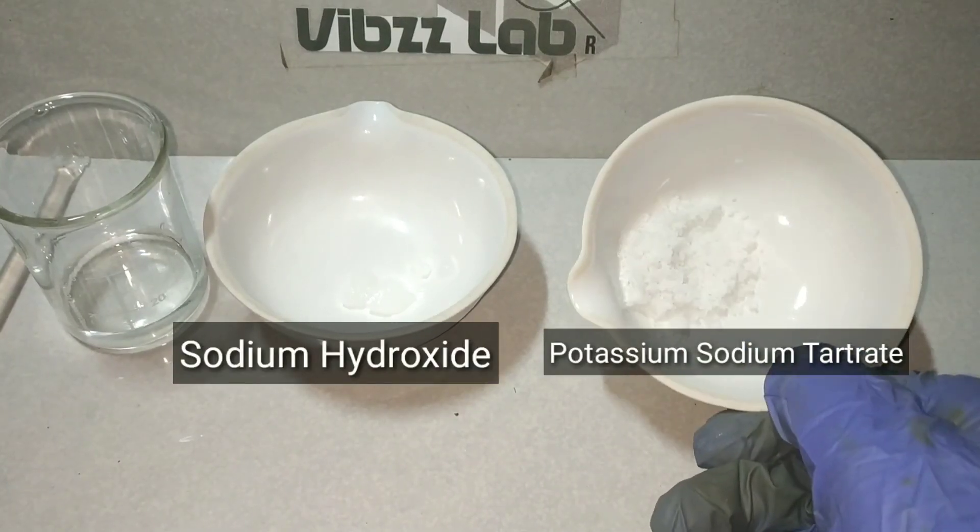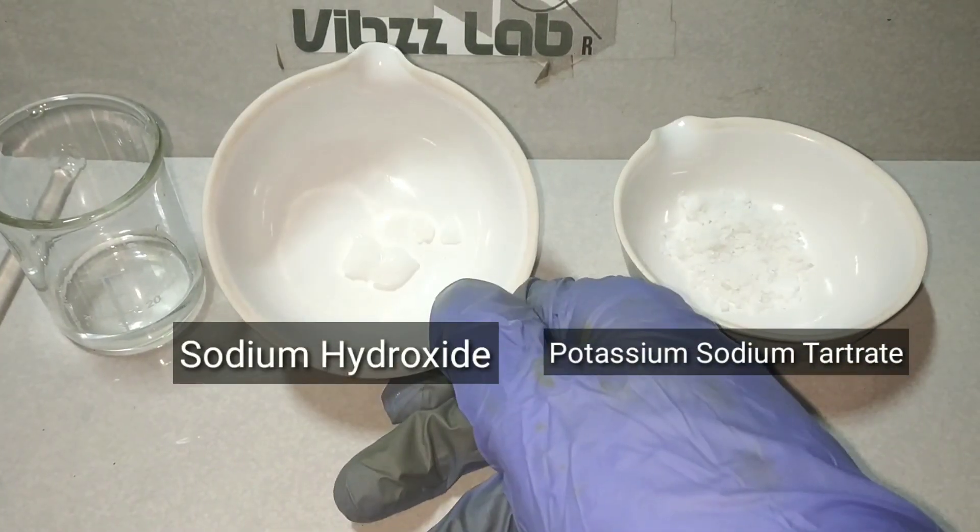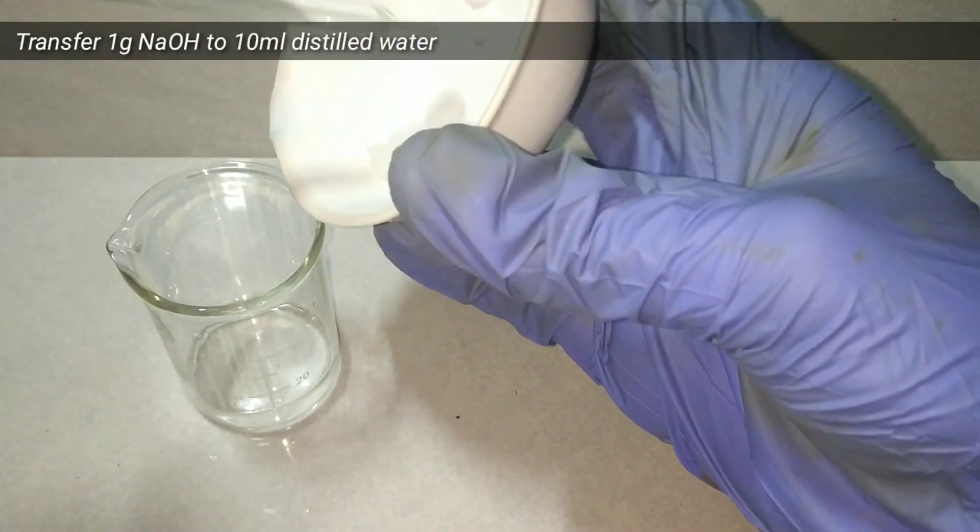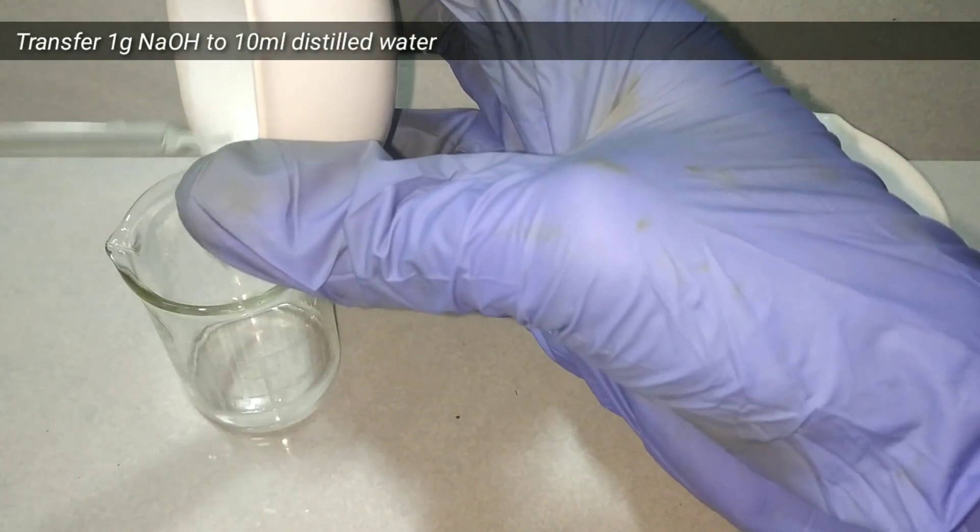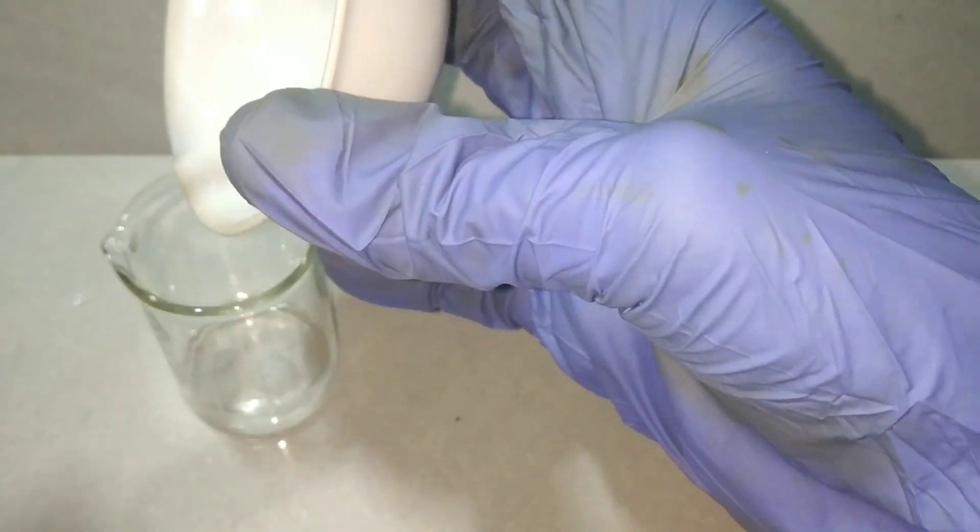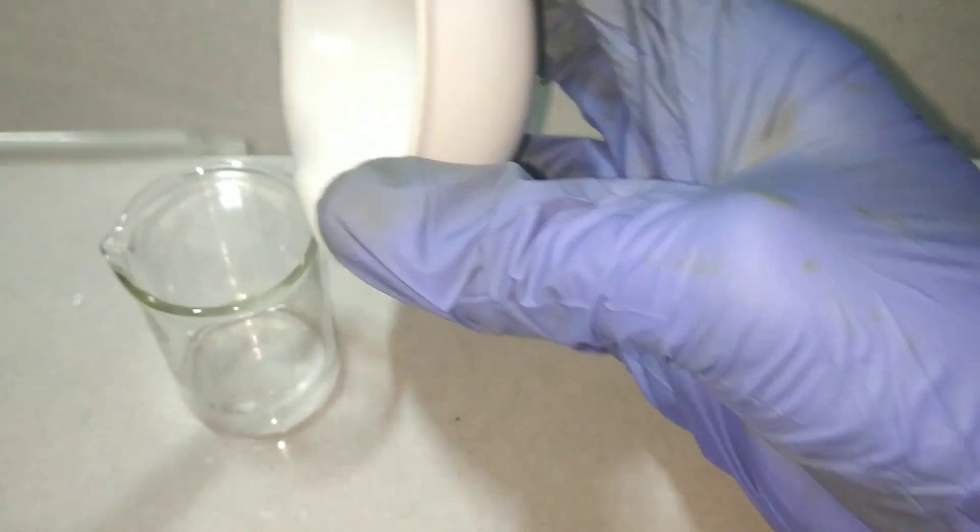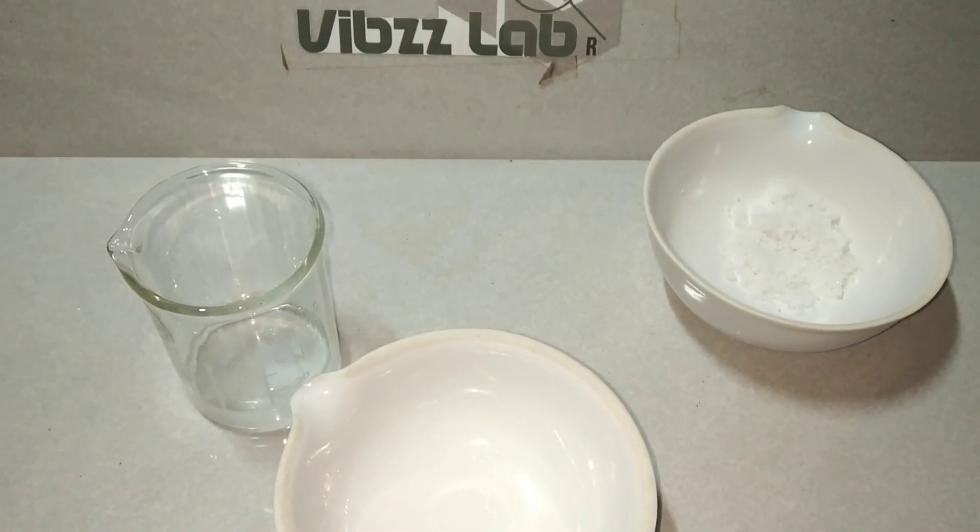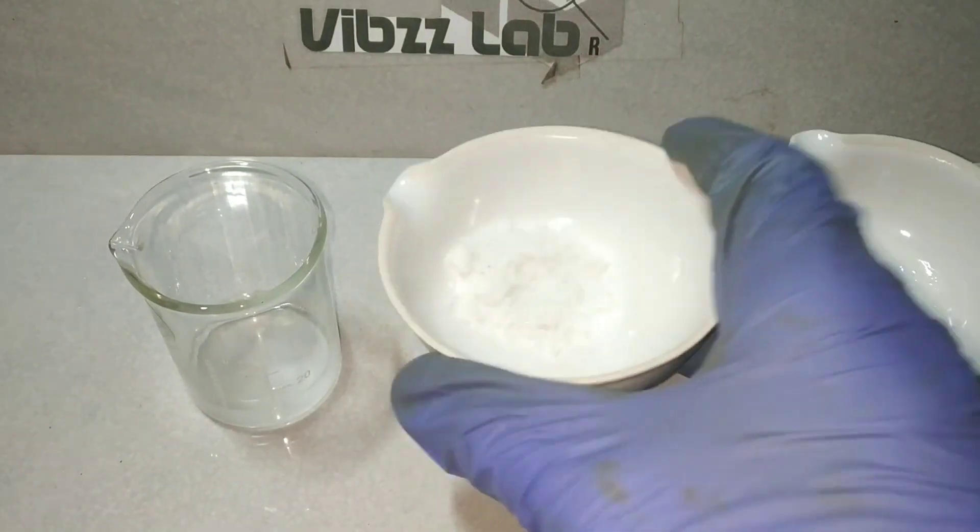Now for making Fehling B solution, we need 1 gram of sodium hydroxide and 3.45 grams of sodium potassium tartrate for 10 ml of the reagent. Start by dissolving the pre-weighed sodium hydroxide in 10 ml of distilled water. Into that, we add 3.45 grams of sodium potassium tartrate and mix them well.